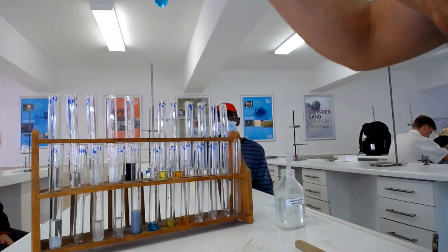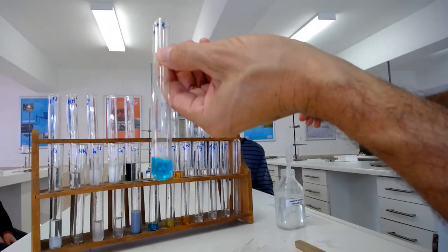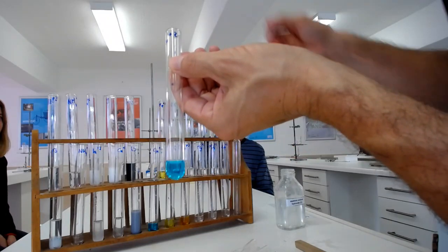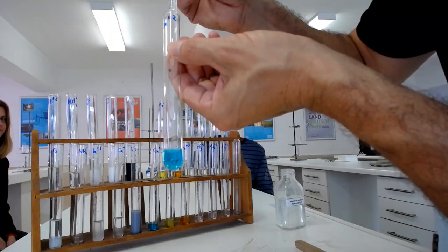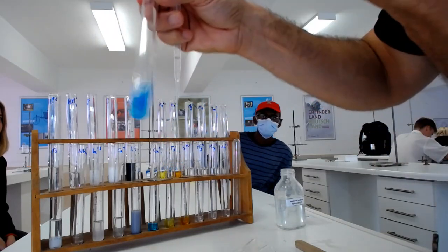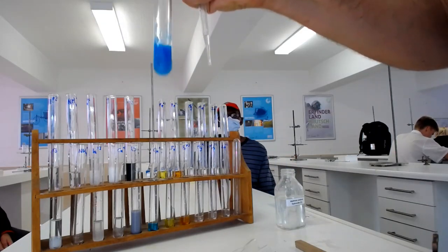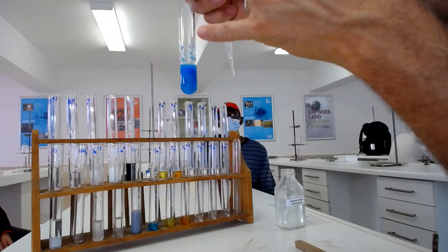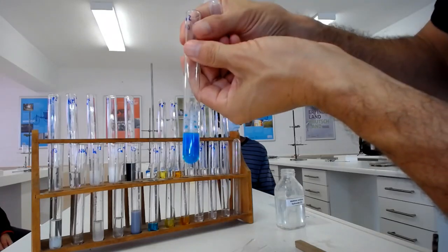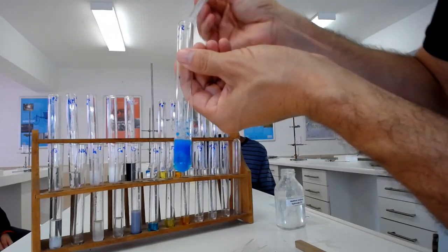Now, copper is the nicest color. I told you yesterday, Andrea, copper is my favorite ion. So here we've got blue. Adding my sodium hydroxide, what happens? I get a nice blue precipitate. Look at that nice blue precipitate. You can see the granules through the side. All right? Blue precipitate. What happens if I add this in excess? It's insoluble. It stays insoluble.